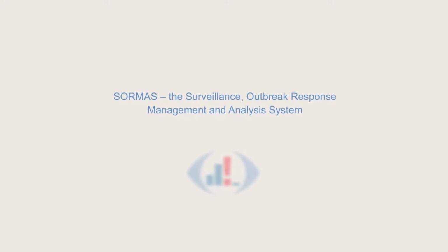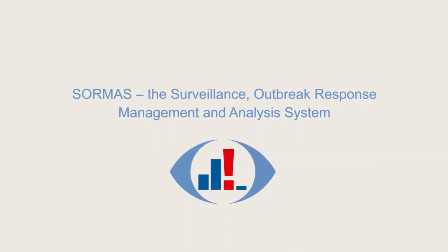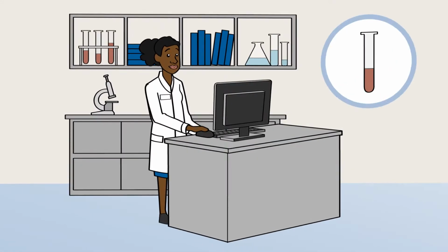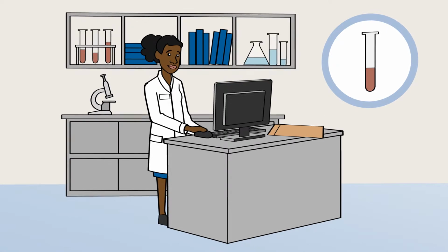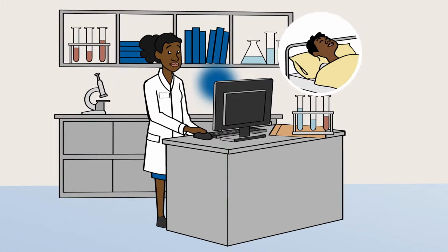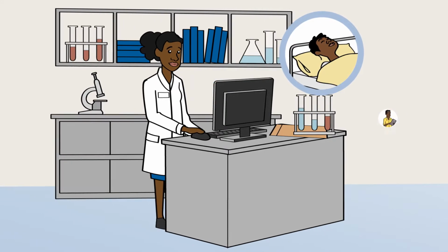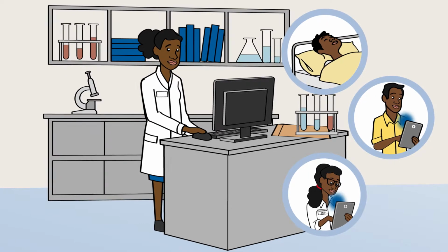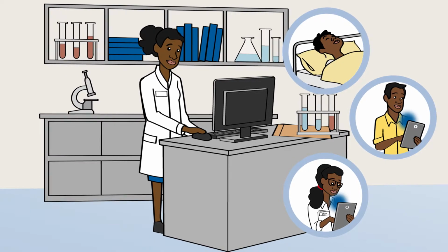SORMAS, the Surveillance Outbreak Response Management and Analysis System. How to use it as a lab manager. As a lab manager, you are responsible to test and verify samples of suspected cases. With SORMAS, your results reach the health facility and the public health service directly and help implementing control measures without delay. By using SORMAS, you can save many lives.